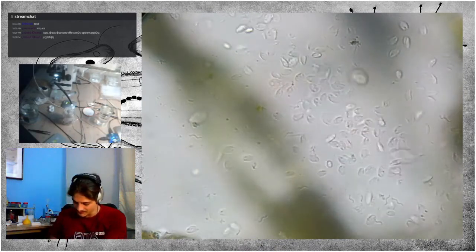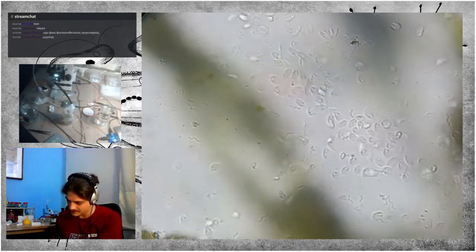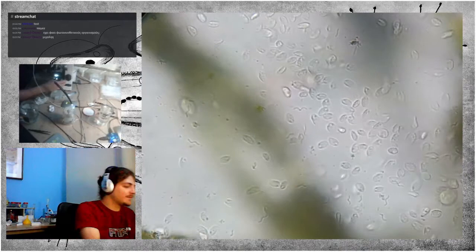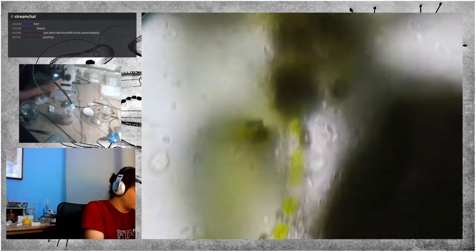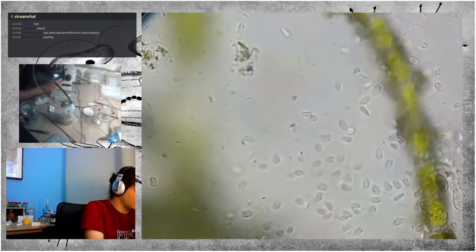Sometimes I cannot remember names. Oh, Chilomonas. That's the one. And that is quite a high concentration.